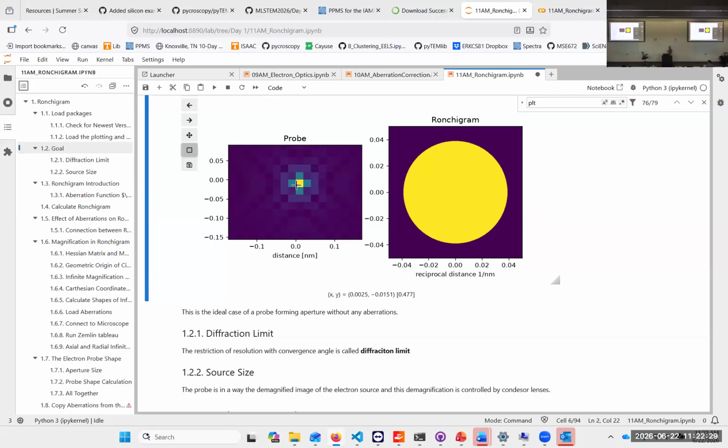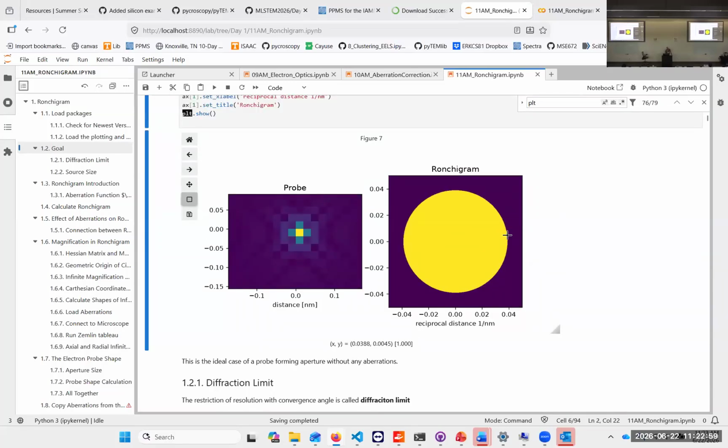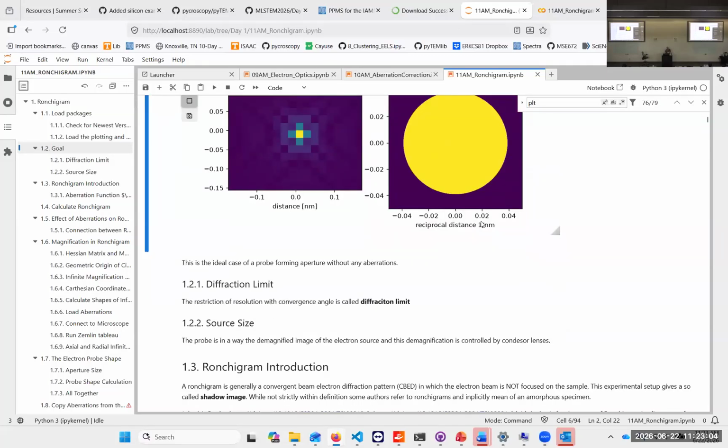And so when we are on the microscope or on the remote computer and access our images, there is no image analysis necessary anymore to really see directly what you got. So the key thing is we're past where we need the resolution, but we really want the contrast in our images. And so we want to have as large as possible of a coherently illuminated aperture.